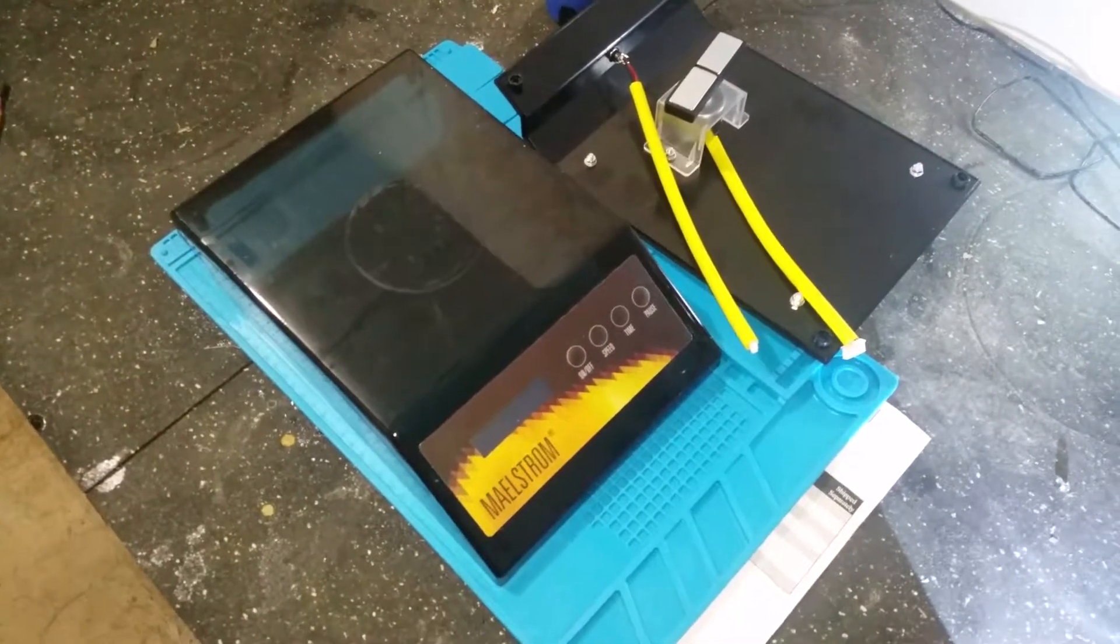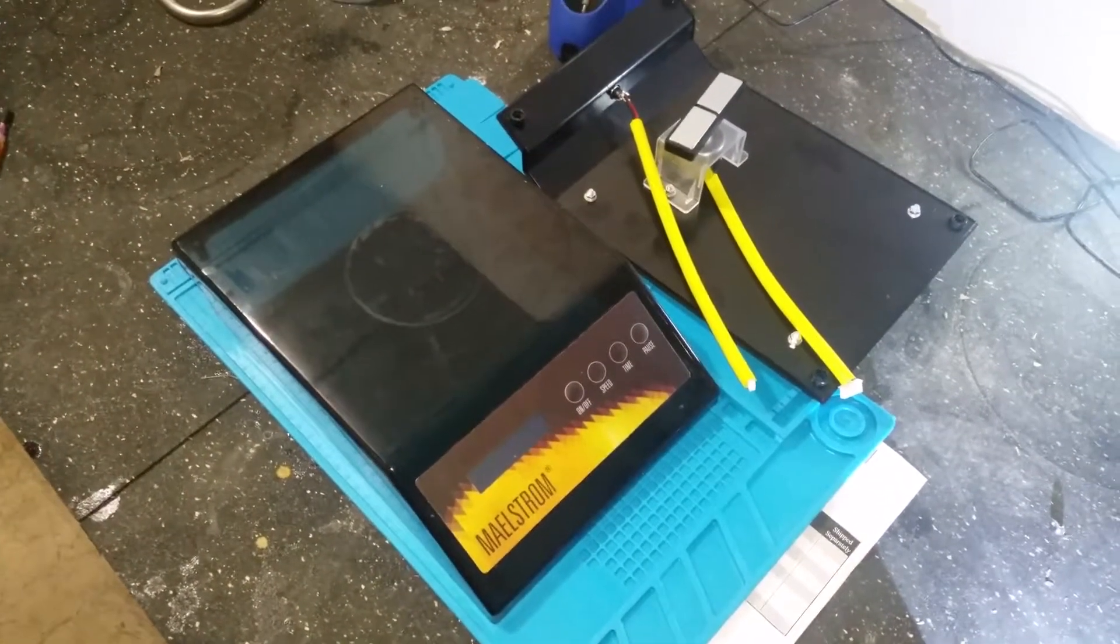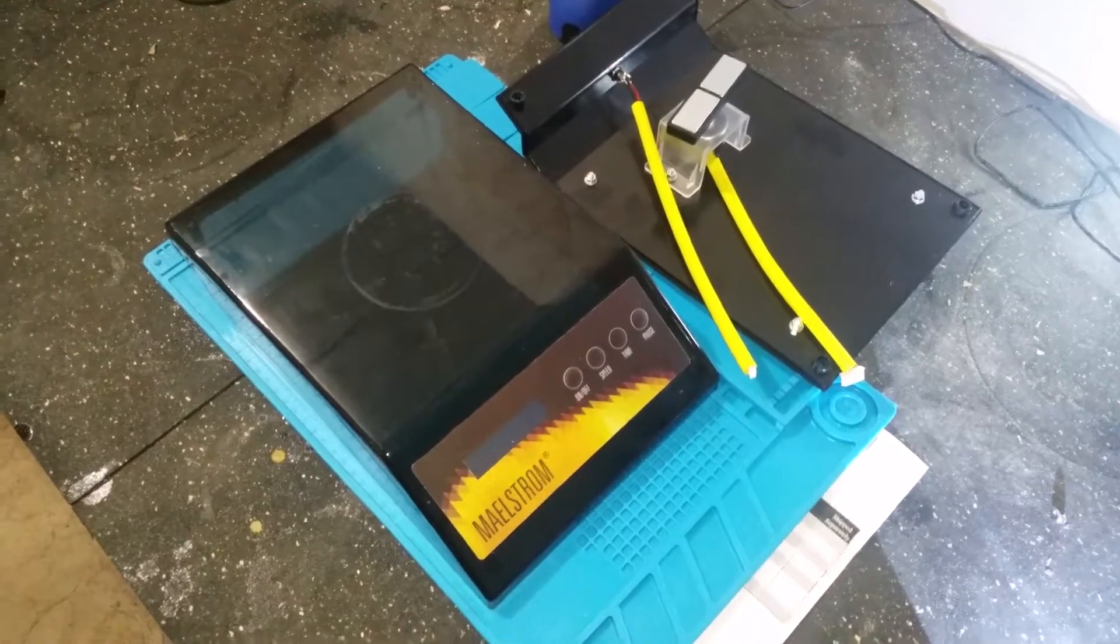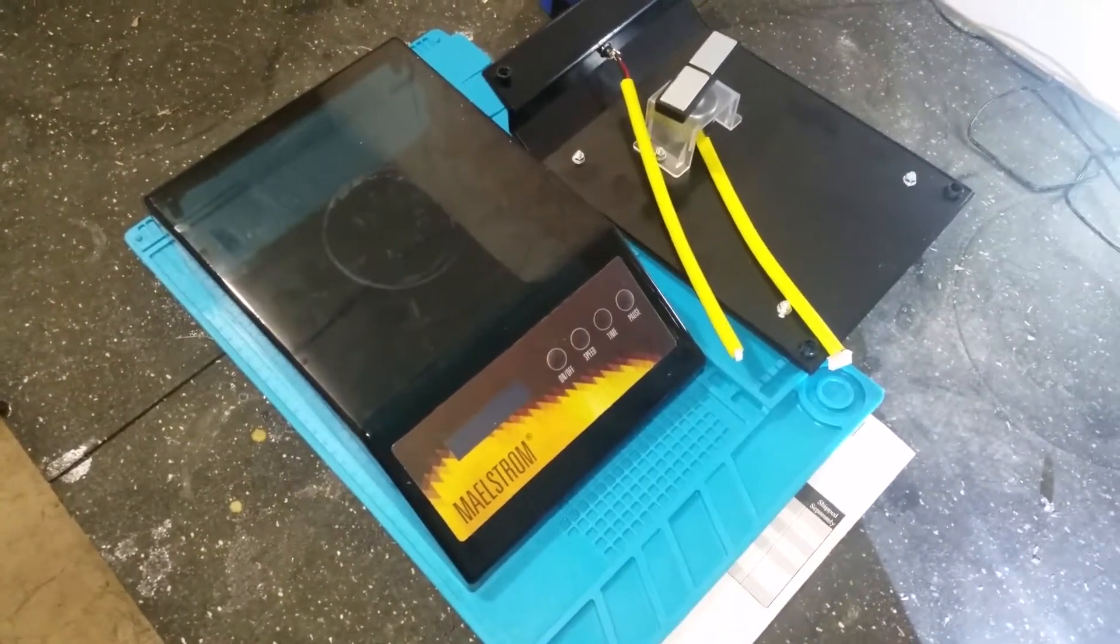Okay, this is the Maelstrom stir plate and some of the issues I'm having with it.